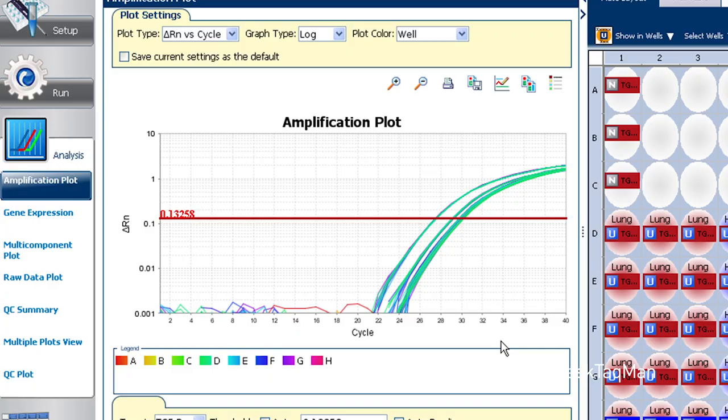Excellent question. The threshold is a horizontal line in our amplification plot that can be moved up or down on the y-axis. Its purpose, as we'll see in a minute, is it tells the software where to take data.